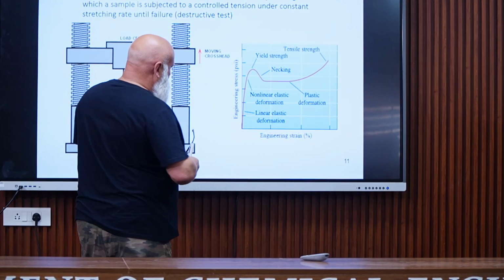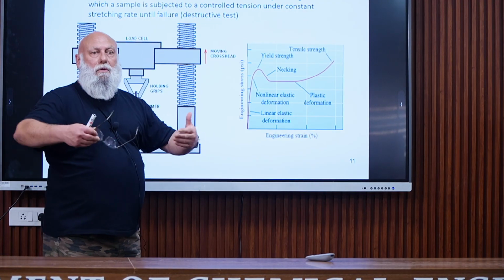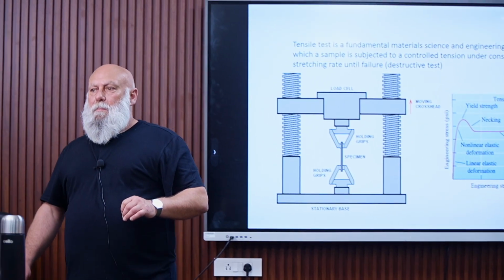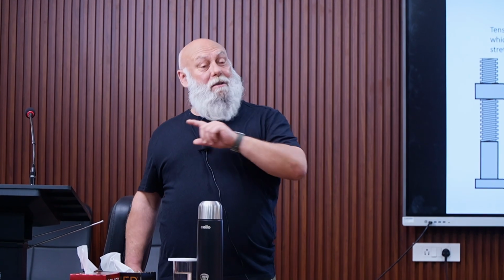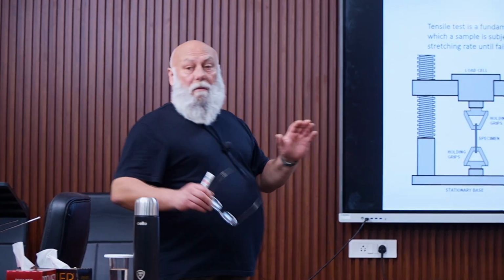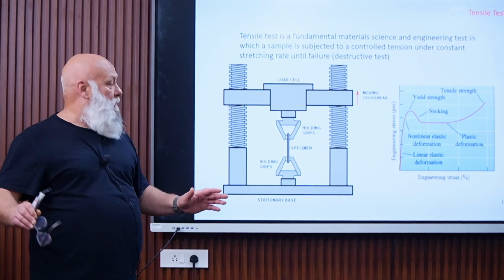Then we can see that there is a loss in the linearity of the curve, meaning that we are out of the linear range. In fact, this is not really the linear range, because the linear range is defined for strain which are lower than 0.1%. Here it's much higher. But anyway, this is the reason why the modulus determined by tensile test and the modulus determined by dynamic mechanical analysis is different.